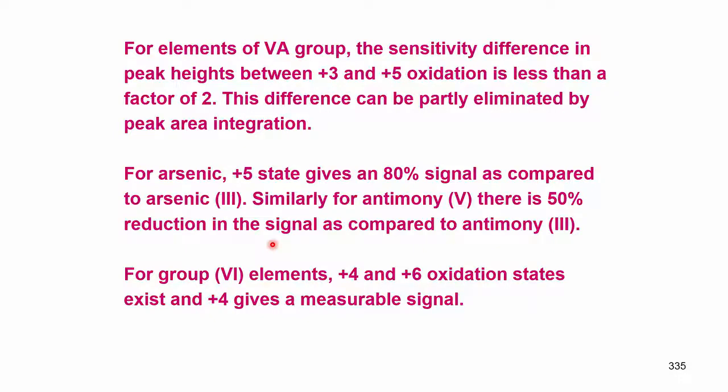So, whenever we want to determine group 6 elements, I can have a speciation, that means determine whether the element is in the +6 oxidation state or the +4 oxidation state. Okay. So, we will continue our discussion in the next class.